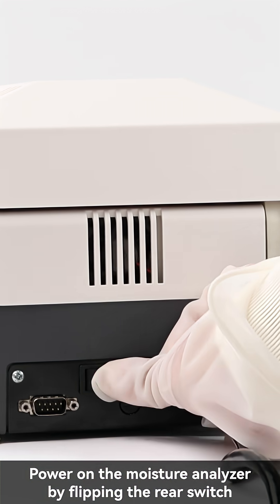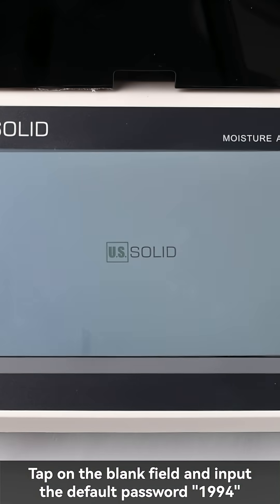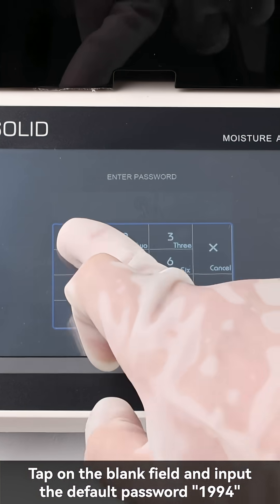Power on the moisture analyzer by flipping the rear switch. After the power cord is connected, tap on the blank field and input the default password 1994.